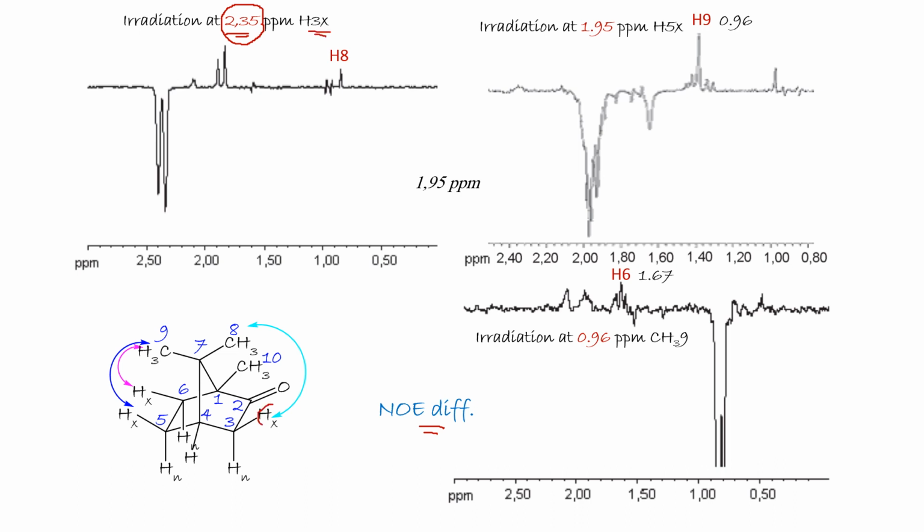When we irradiate, we enhance H3 at the 8 position. This is nearby. So I knew that this position belongs to H8, CH3.